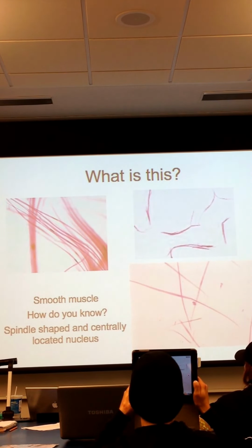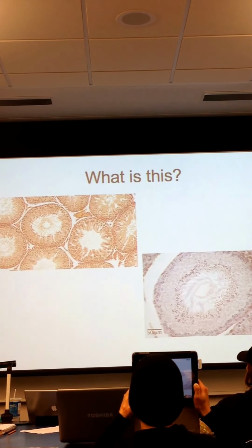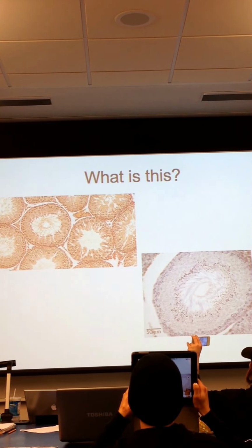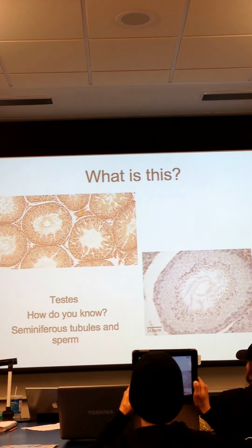Is it alright if I switch? What is this? It's not sperm. It's the rat testes. Good. Okay? And how do you know? Well, because of the sperm, right? So, this is a lower magnification than we've zoomed in to see these cells over here.